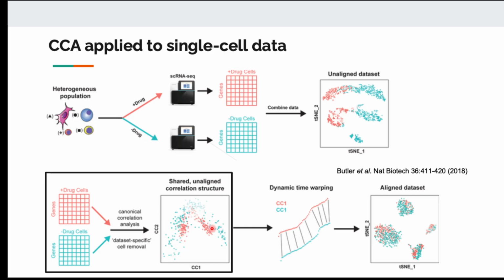It doesn't have to be exactly this pattern, but it's going to show some mapping between cells from the untreated to cells from the treated. And you see a V structure, so you see that these cells from the untreated are probably the same cell type as these cells from the treated condition. And on the other side, you see some parallel structure between treated cells and untreated cells. So these are probably the same cell type.